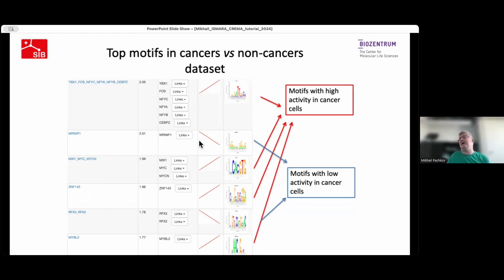So you see, even with very large and very heterogeneous data sets, with the averaging procedure, you can obtain some very interesting insights on transcription factors, on regulators, which are driving changes between different groups of interest, which you can choose from the set of samples.